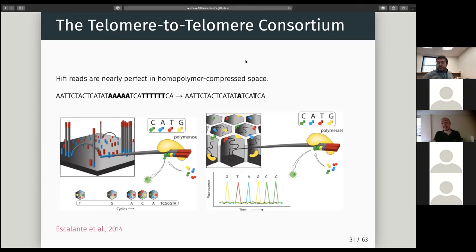But by contrast, being able to tell that there is a different nucleotide coming is much easier. Illumina claims they don't have this problem with homopolymers, but that's not completely true. Some homopolymers can create palindromes. Essentially you have a series of A's and a series of T's. This library will fold and will not be able to sequence properly. So you create this hairpin, and you cannot stick it. Illumina has less of an issue, but still some issues in certain cases.